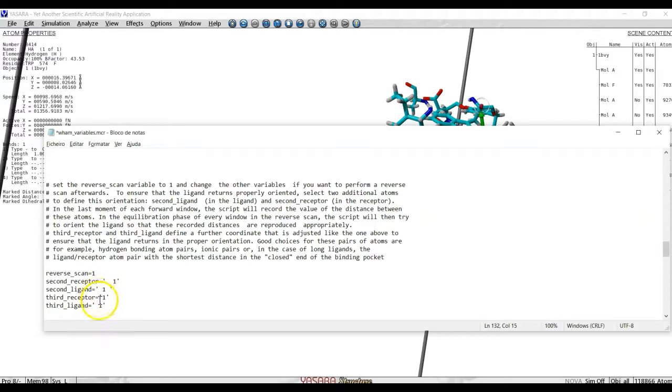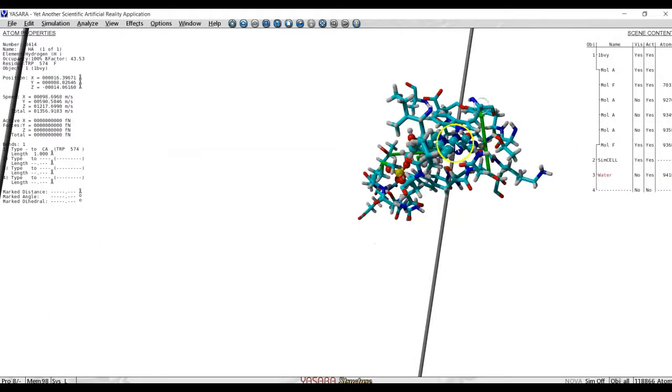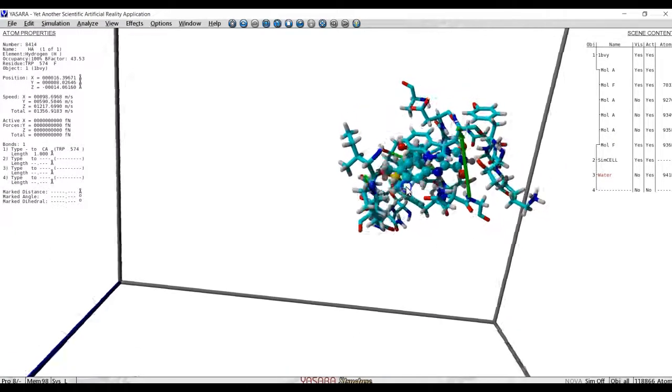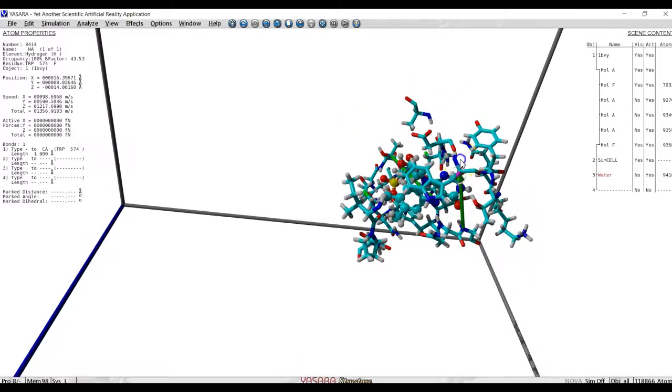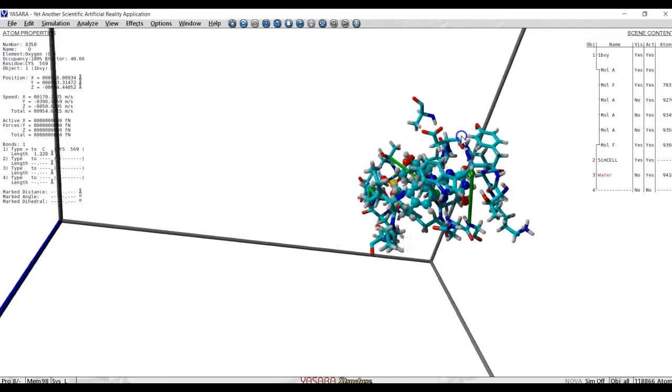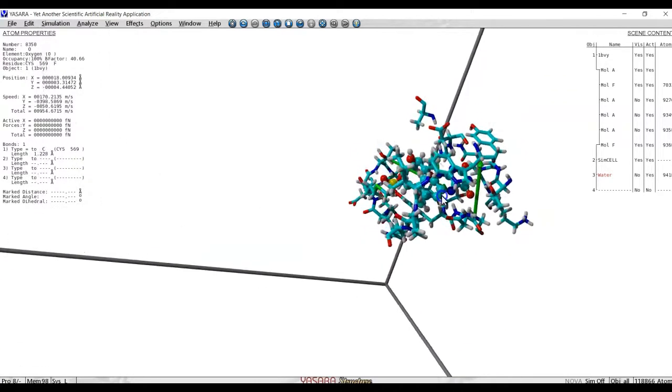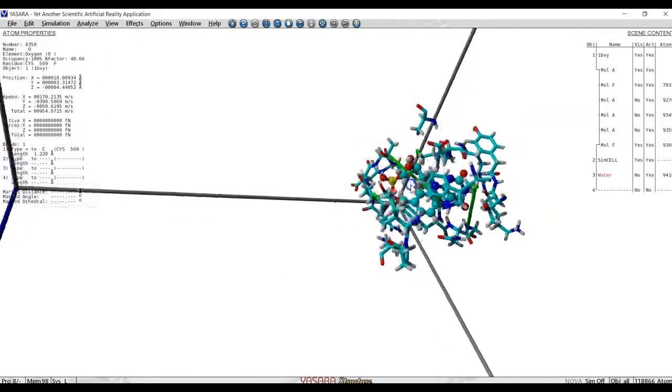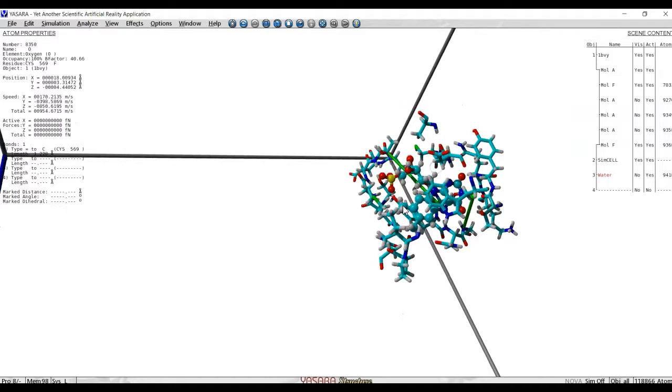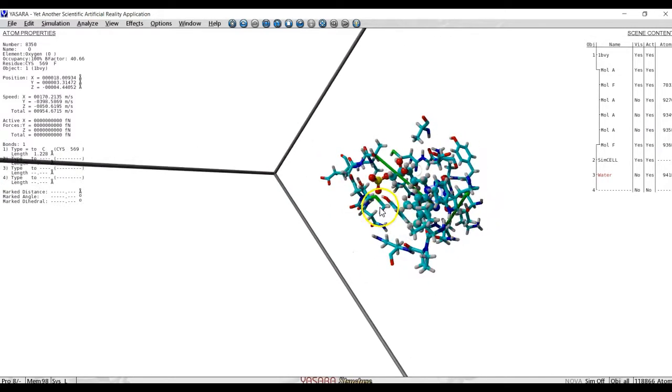If we want to perform the reverse scan, those 2nd receptor, 2nd ligand, 3rd receptor and 3rd ligand atoms are the ones that will help guide your ligand back into the pocket in more or less the same conformation that it left the pocket. For example, we could select for the 2nd pair of receptor ligand, we could select, let's say, this as 2nd ligand and this atom which is close by as the 2nd atom of the receptor. And for the 3rd atom of the ligand, we could select this one. And for the 3rd atom of the receptor, we would choose, for example, this one, something that is close to it at the beginning.